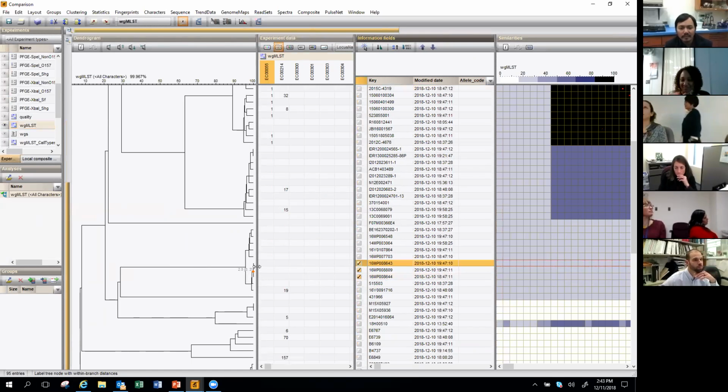in that branch. So this looks like it's two allele differences, which I would consider pretty close. Then you might be curious, what are the two below it? Are these guys also related? You can click on where that node connects all these guys, do the same thing, and find out that we're now up to 68 allele differences. So we know the bottom one isn't related. The median's 46, so it's likely this one isn't either, but these three might indicate you have a cluster.